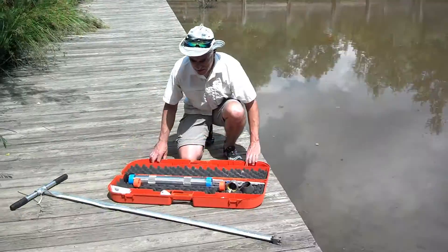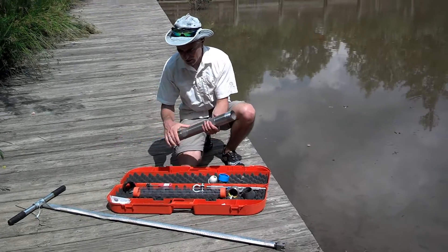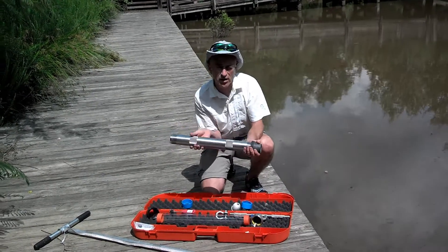The coring device has several components. To start off with, we have the stainless steel corer barrel with a cutting bit that gets threaded onto one end.